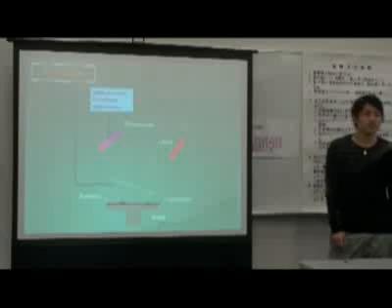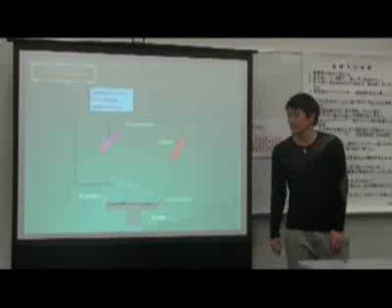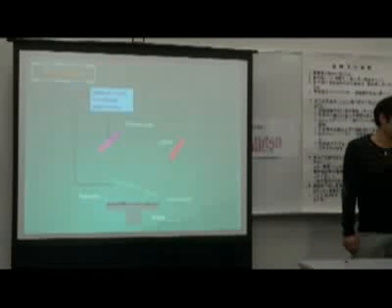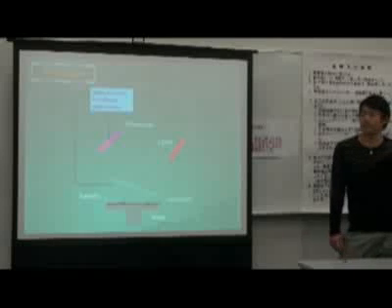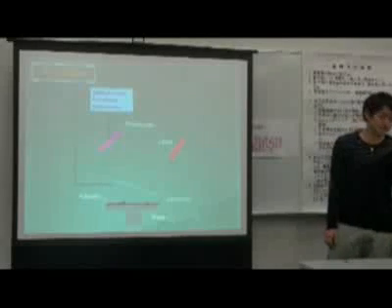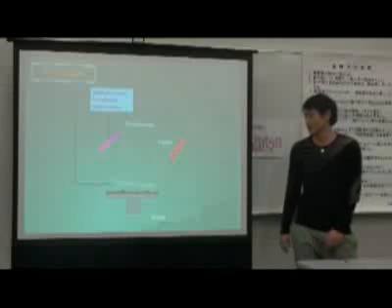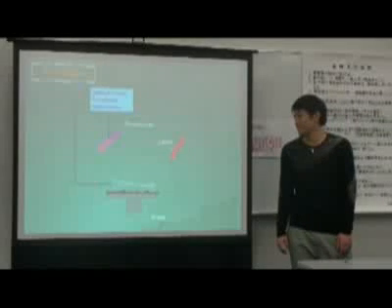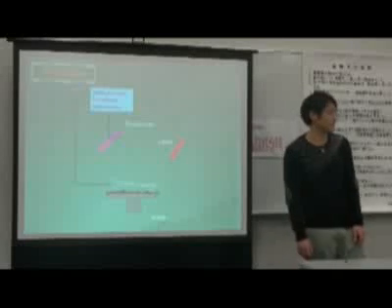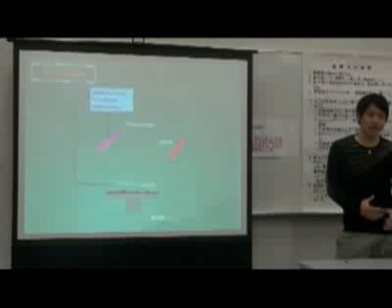This is an illustration to explain the previous illustration in more detail. First, the laser spot reflected from the top of the cantilever is measured by the photodiode, and the scan starts. When the scan starts, the stage to put the sample on is moved along the axis for contacting the cantilever. The cantilever changes shape.